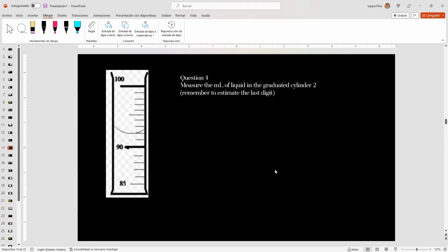Well, here you have question 4. Stop the video and do your measurement. Remember to report this in a piece of paper and later you will write everything in the last page.